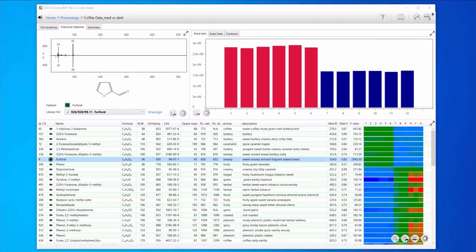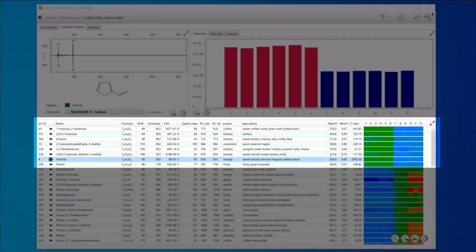Our table here is sorted by heat map. At the top of the table we can see some of the analytes that are higher in the medium roast coffee. We've added aroma notes and we can see some descriptors like bready, buttery, caramel, creamy, and coffee.